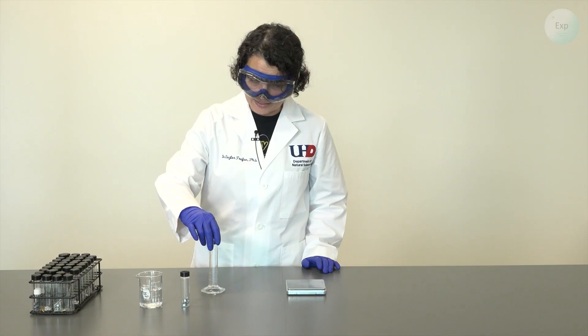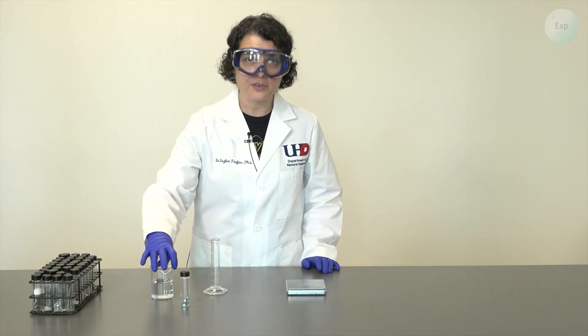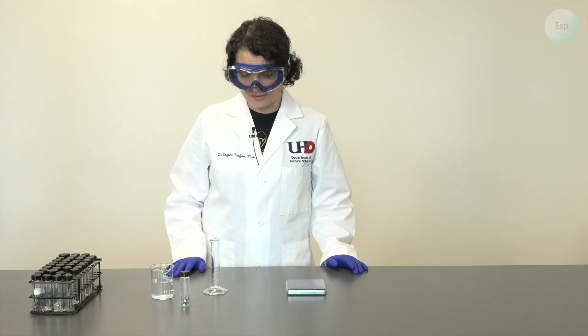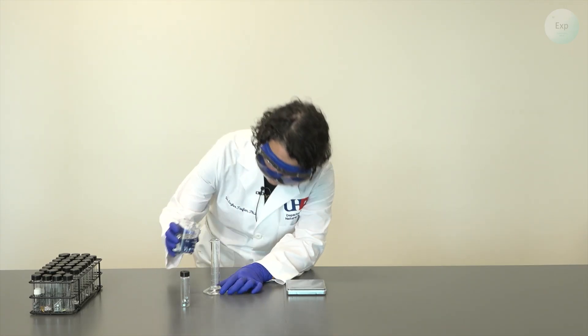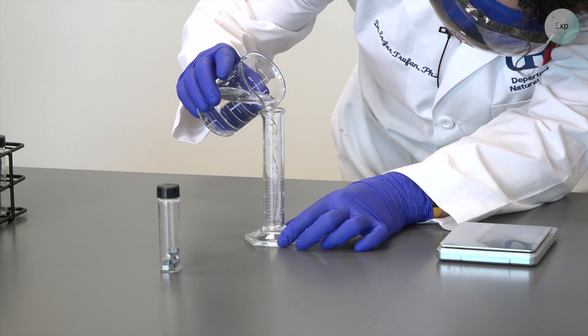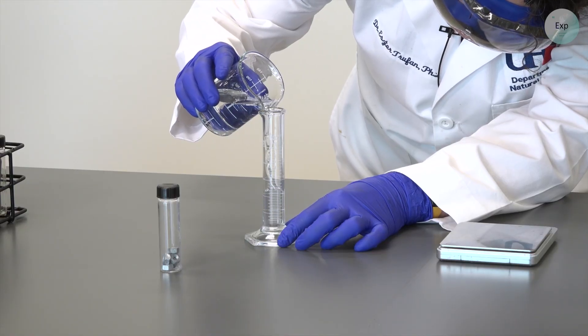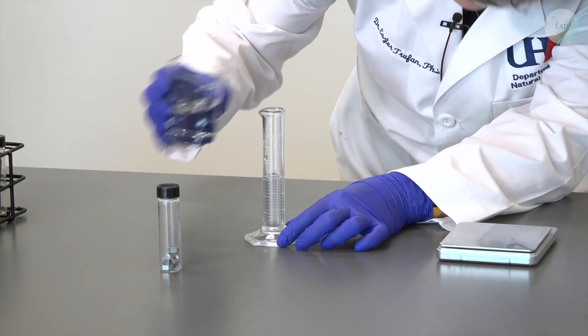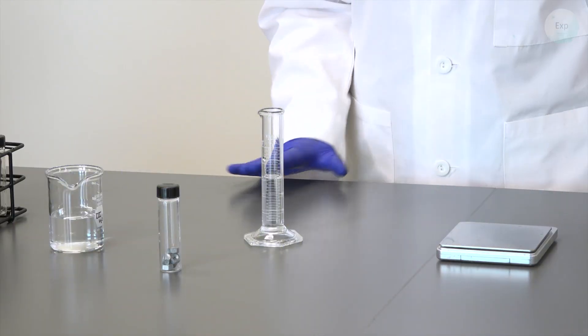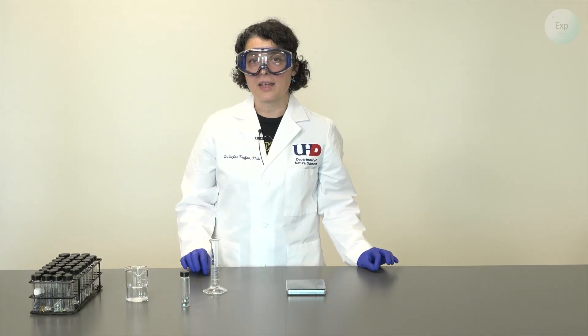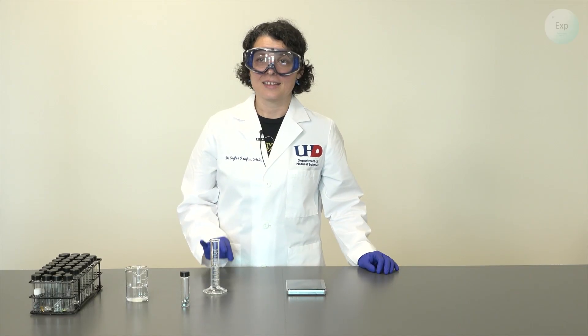The first thing that I'm going to do is pour approximately 15 milliliters of water into my graduated cylinder. This does not have to be exact but rather approximately 15 milliliters. The important part here though we need to record that volume as exact as we can.